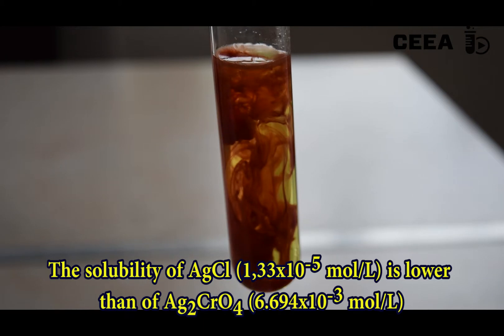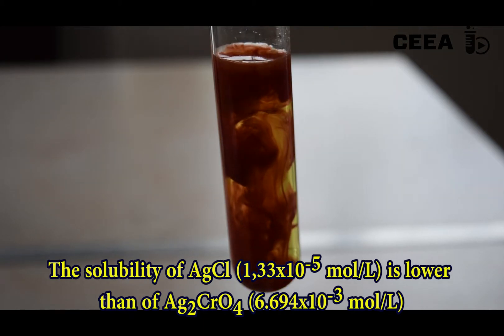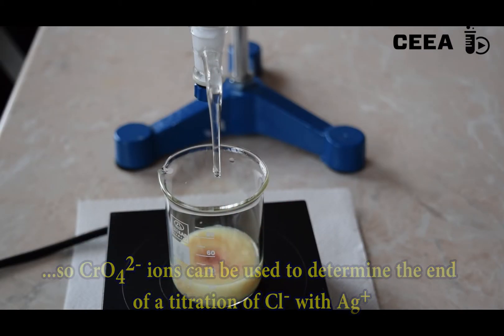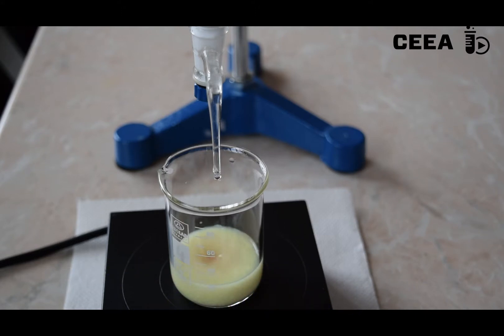Based on a solubility difference between silver chloride and silver chromate — the first being lower — an analytical method can be set up for titrating chloride ions with silver nitrate in the presence of chromate. Red silver chromate shows up only after all chloride ions have been consumed to form silver chloride.